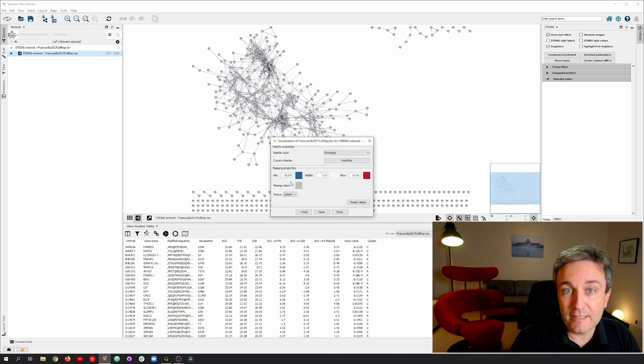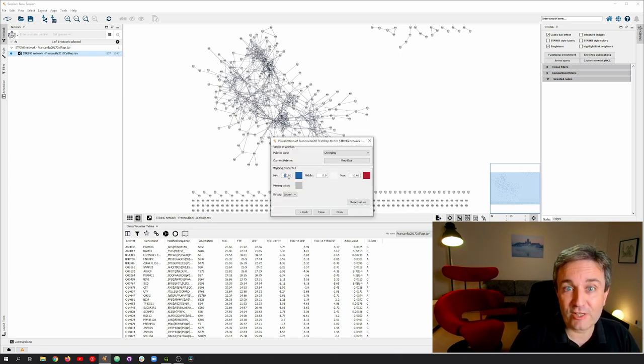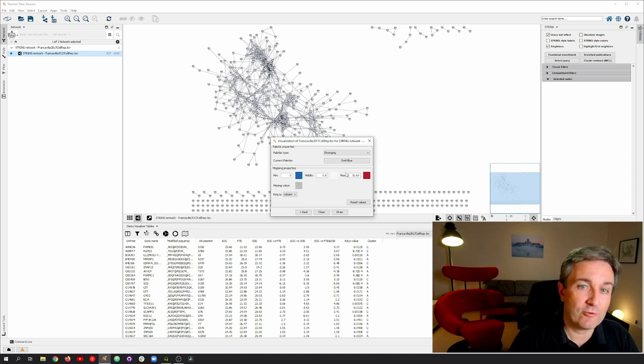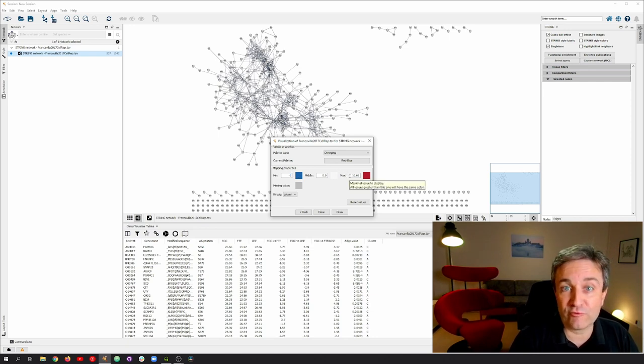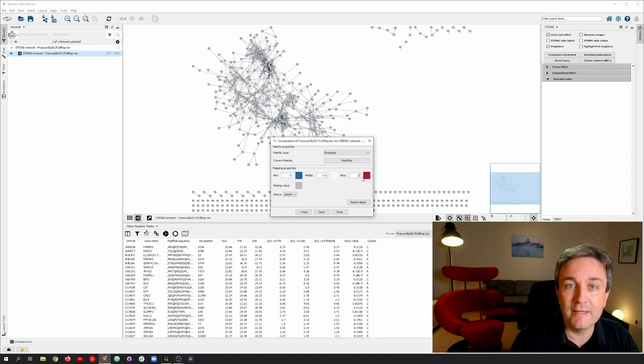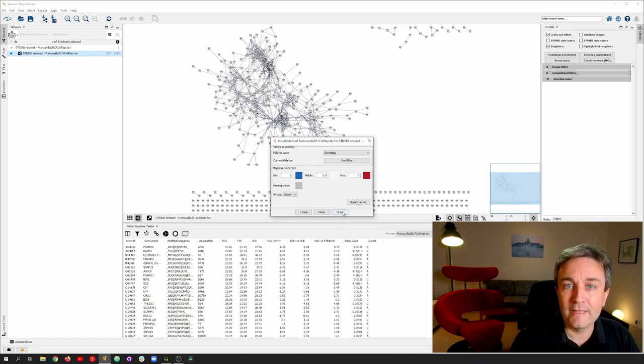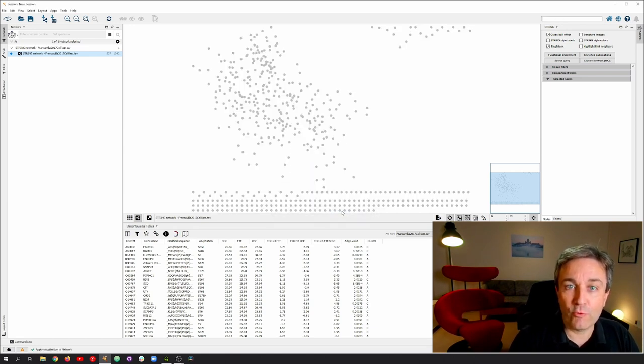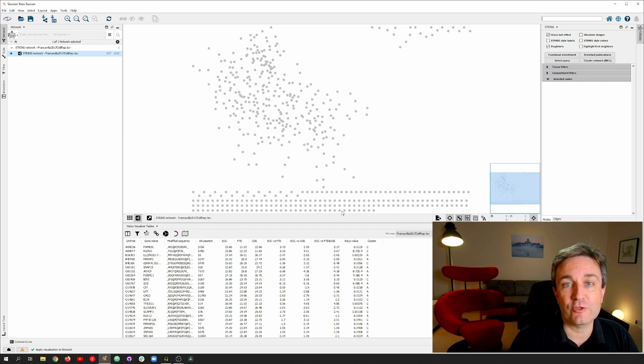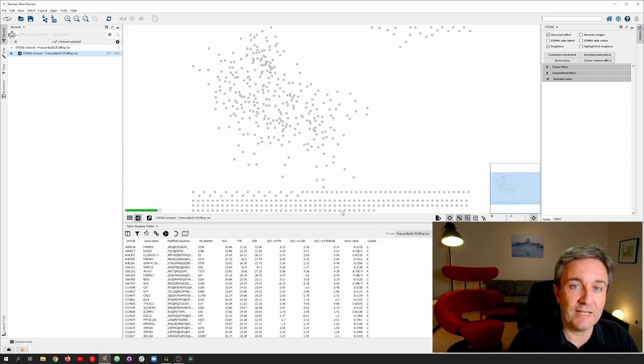Here, I adjust the color scale for the color gradient to go from minus 5 to plus 5 on the log fold change scale. And when I click Draw, it will draw the Omics Visualizer donut visualizations onto the nodes in the String Network.